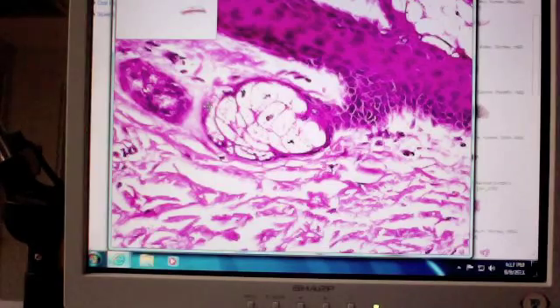Where's my next one? Sebaceous. It's a sebaceous gland, and if we're talking strictly in terms of ductal structure, it belongs to a simple branched gland. That will be sufficient. All right. I know we have alveolar in the text, but I have said to you, just take alveolar out. I very seldom see that term used anymore.